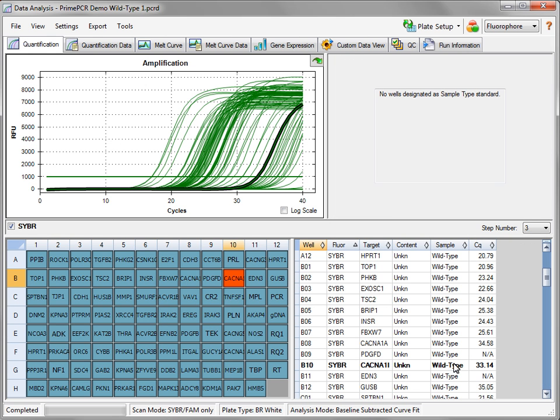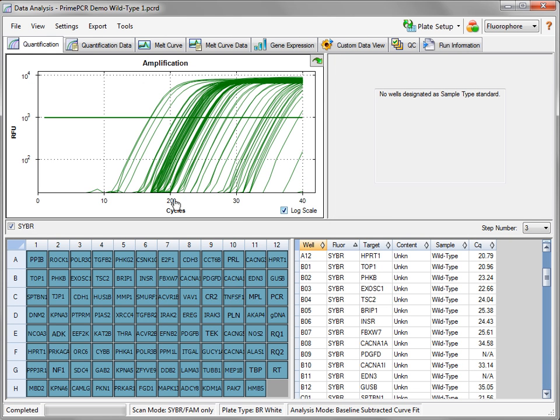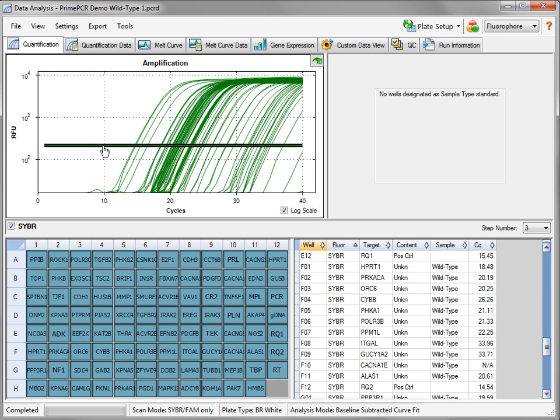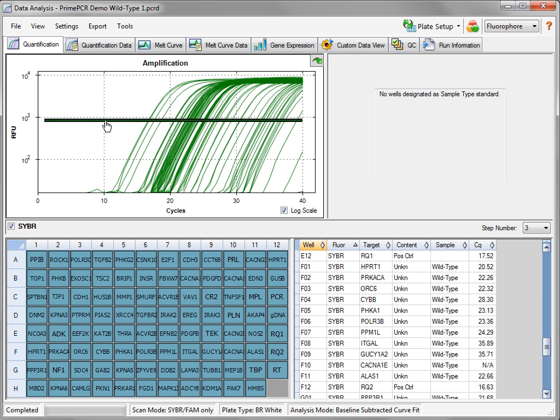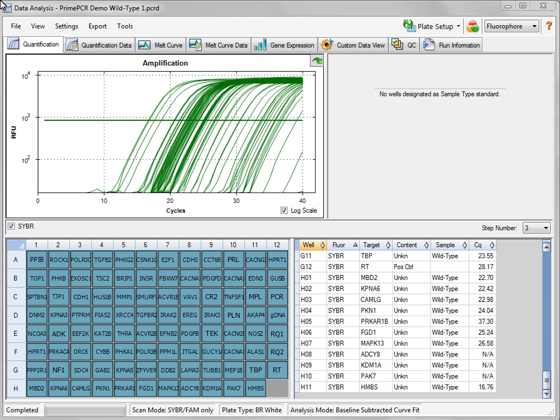To adjust the threshold used for calculating the CQ values, select Log Scale and then click and drag the threshold line to the desired location. The threshold should be positioned at least one log above the background, but below the region in which the fluorescence is starting to plateau.